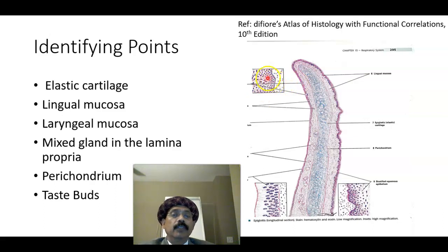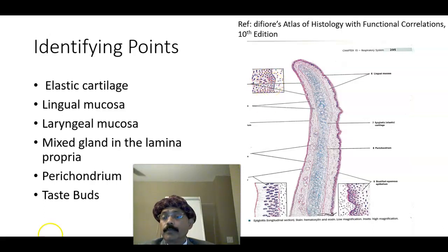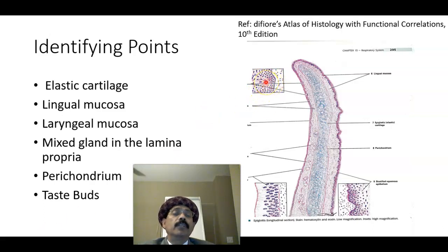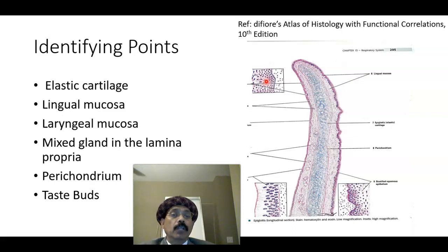These are the modified epithelial cells that form the taste buds. Taste buds are present in the tongue, but not only in the tongue — they are also present in the epiglottis, in the palate, especially the soft palate, and the upper one-third of the esophagus.